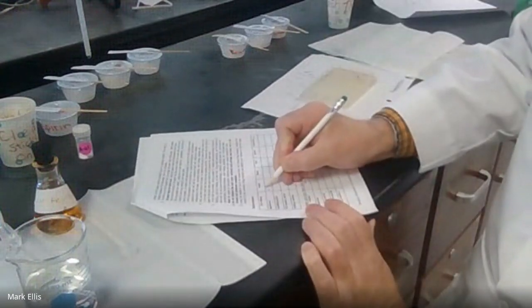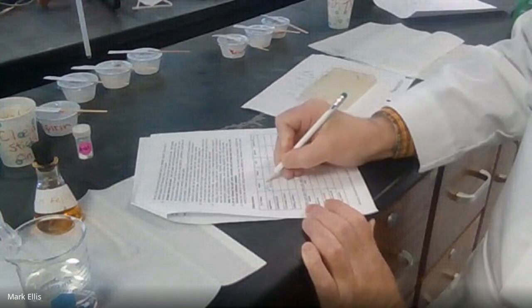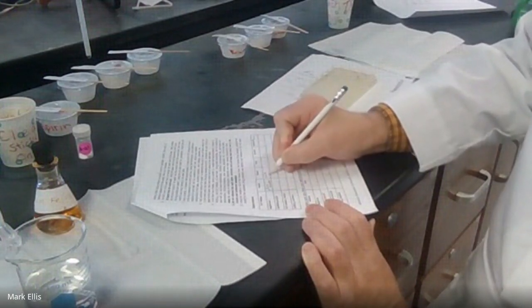So I would just put in here, it's just white powder, white granules. In fact, if it's that same way all the way across, just put an arrow all the way across. But that's what it is.